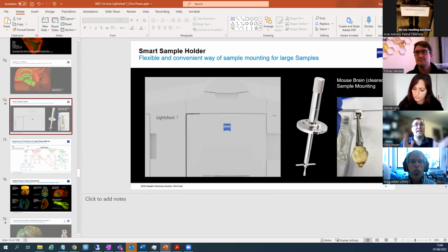One of the ways I've heard light sheet phrased is the good news is whatever you try, very often no one else has done it before, but the bad news is no one else has done it before. So we do a lot of very different mounting techniques here. But also the chambers that these fit into with the clearing.